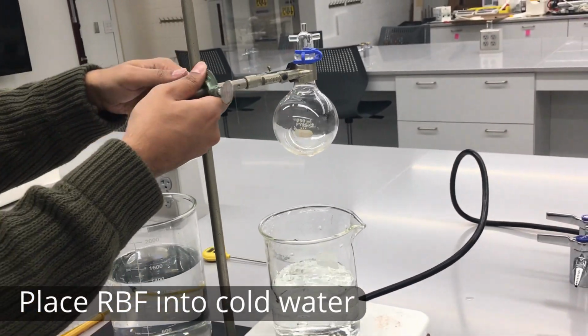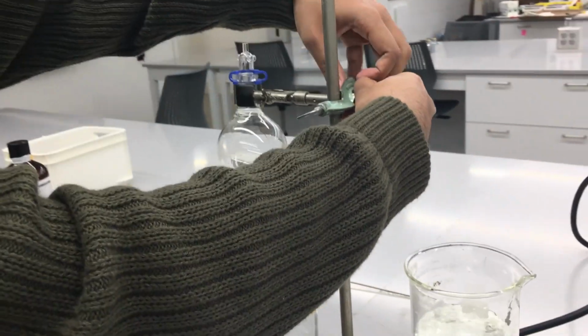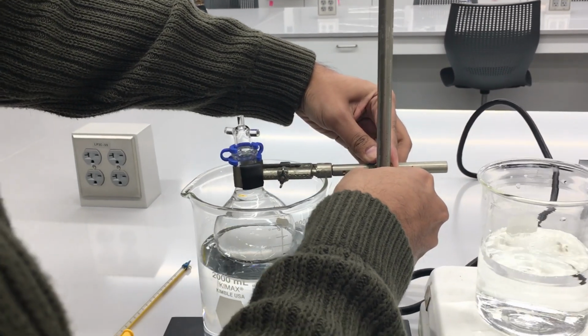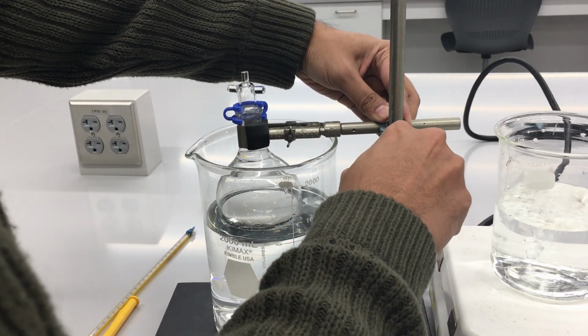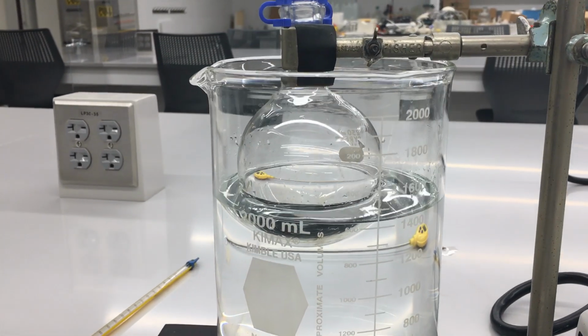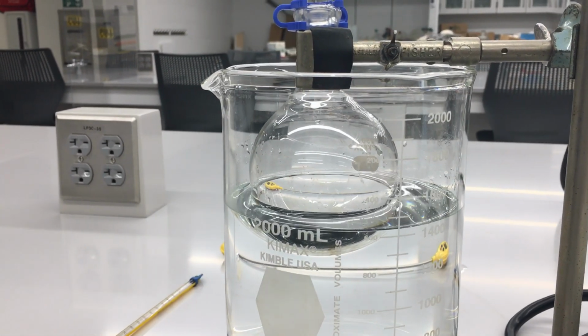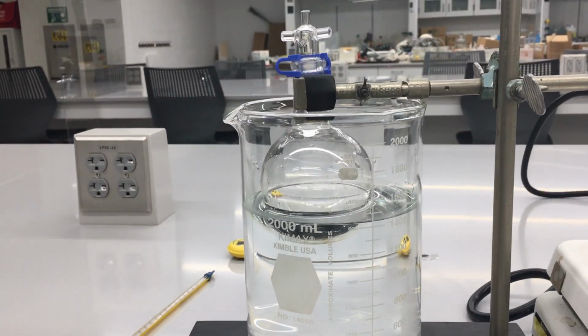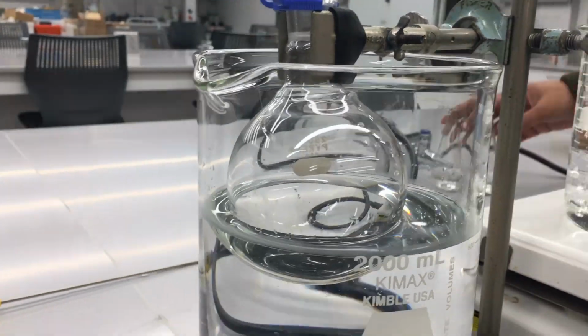Okay, so we see it is 98.6 there, and we've noticed that most of the vapor has stopped escaping from the top. So now it is time to condense down this vaporized liquid. So now I want to take that round bottom flask, which is full of gaseous vapor, and cool it back down. So I'm going to condense that gas down into a liquid by submerging it in a cold water bath.